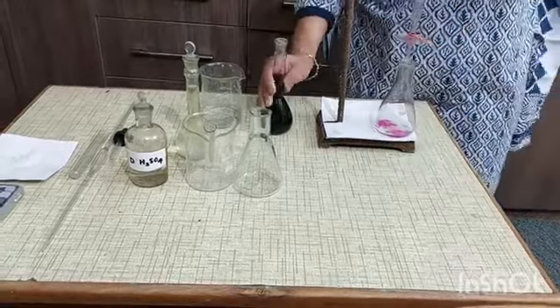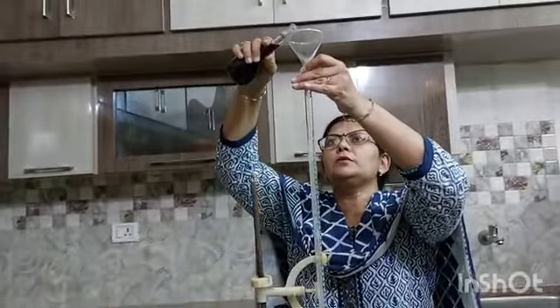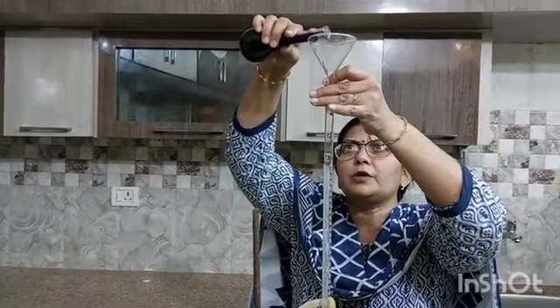Then fill the burette up to the 0 mark with potassium permanganate solution.